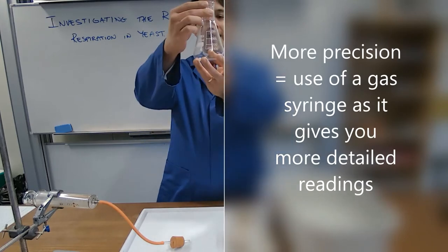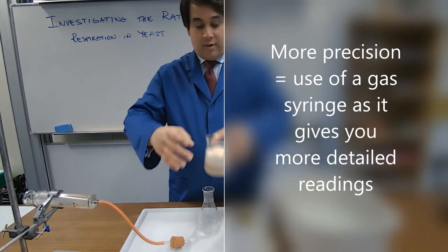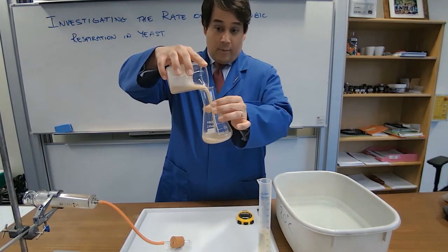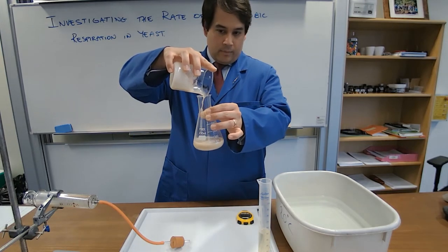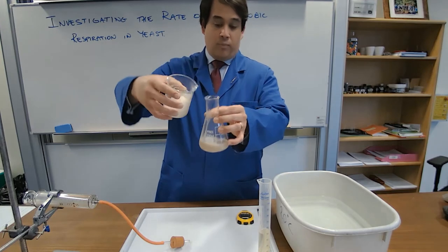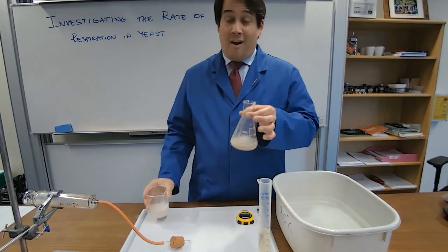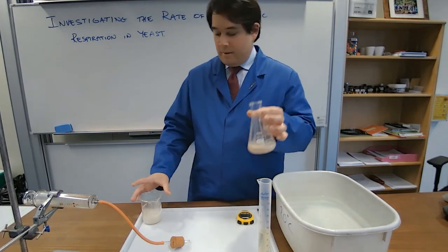So, the main idea is we've got a flask, we have yeast all woken up and ready to go. I pour some yeast into the flask, I pour all the yeast in really. So these guys are now inside here, we have yeast and glucose and some water. They're basically in a very happy environment for themselves.